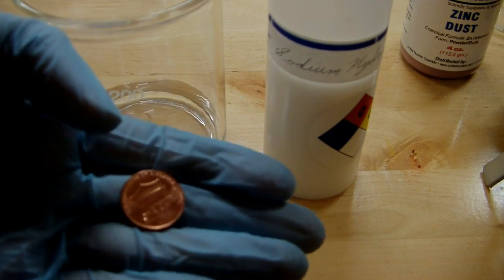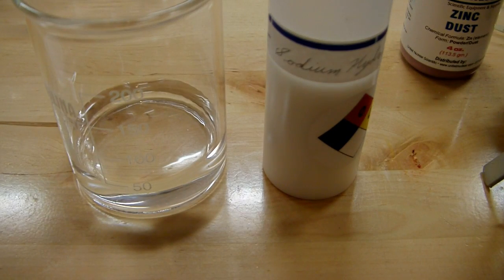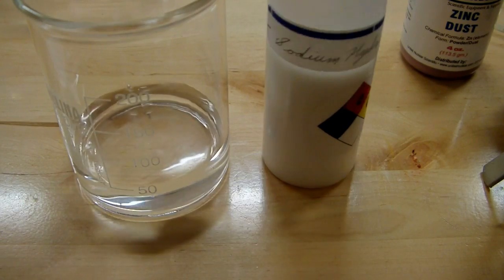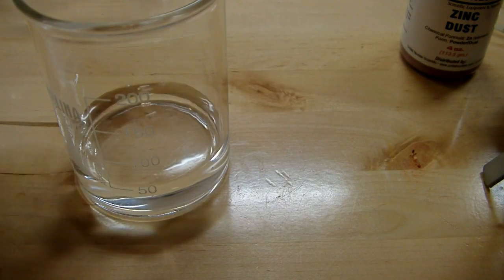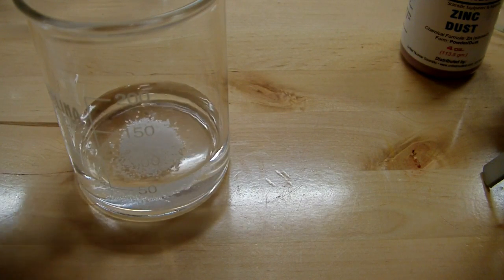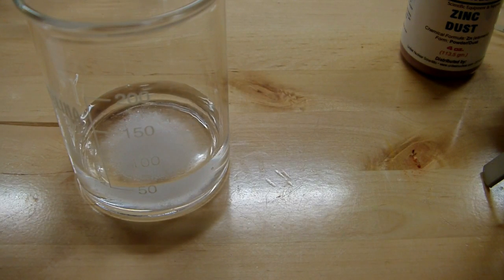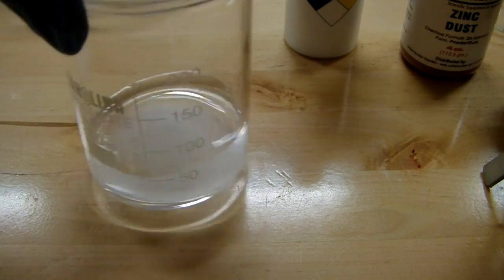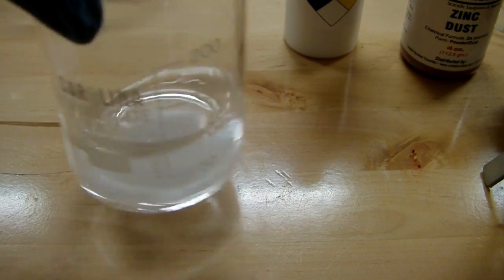I'm going to be using these fancy 2010 pennies with the new backing because they're the shiniest that I have. I've got about 50 milliliters of water here and I'm going to dissolve some sodium hydroxide in it. This is not going to be a particularly rigorous experiment because you don't really need any particular amounts of anything — just a bit of this, a dash of that type chemistry. So what we want is just a basic solution of sodium hydroxide.